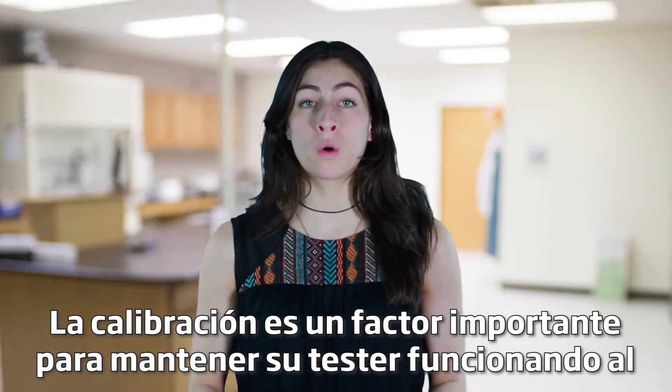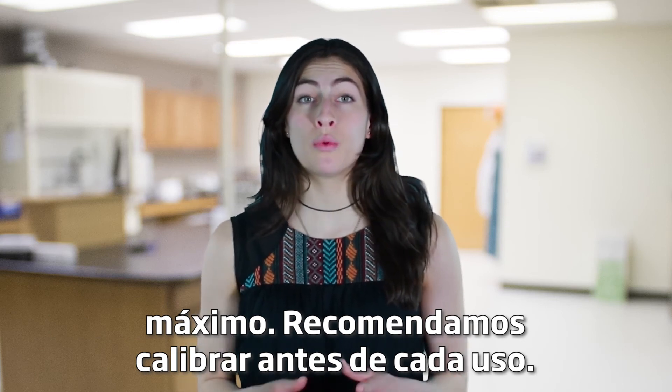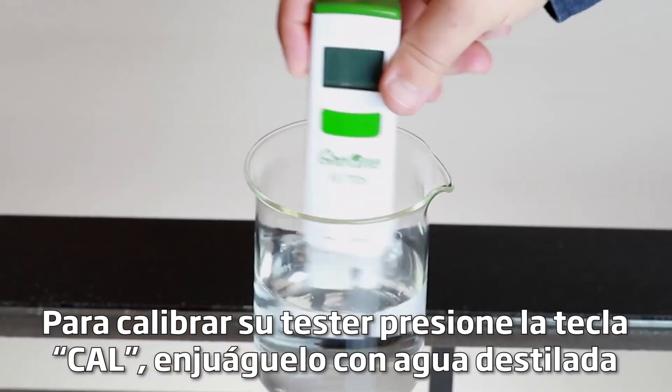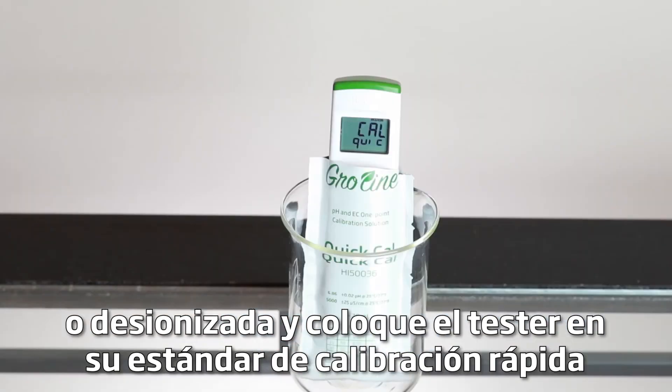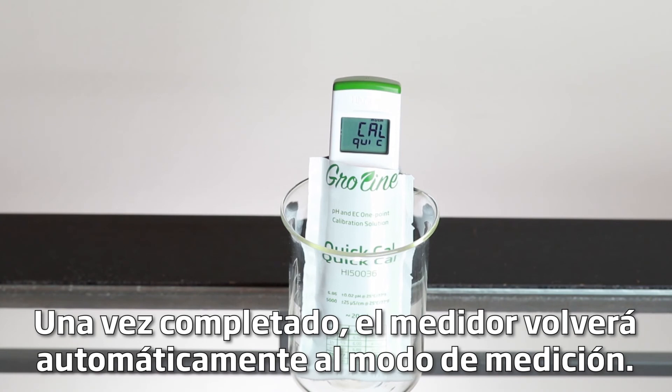Calibration is an important part of keeping your tester operating at its best, and we recommend calibrating before each use. To calibrate your tester, press the CAL key, rinse it in distilled or deionized water, and place the tester in your Hanna GroLine QUIC CAL calibration buffer. After it's complete, the meter will automatically return to measurement mode.